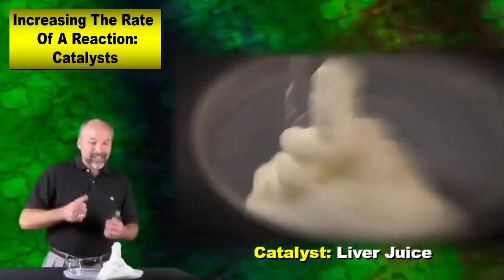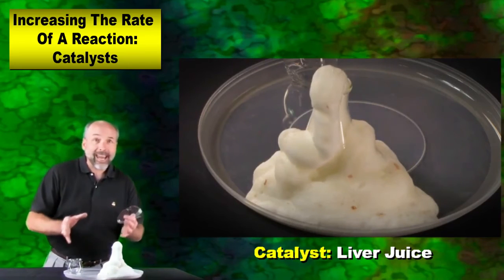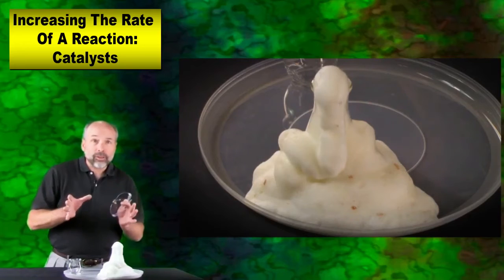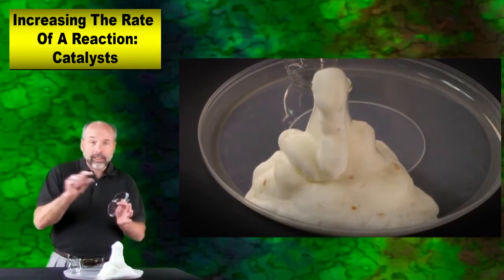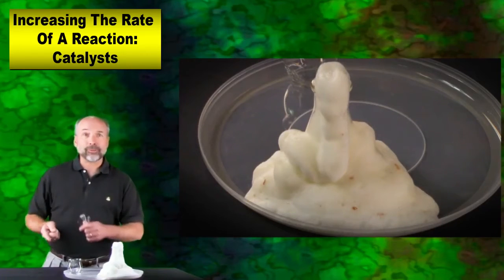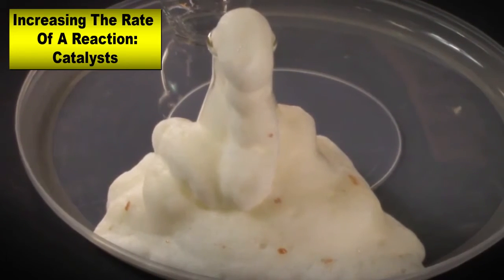Kind of cool. So here we've got this example of 3 different ways we could see catalysts affecting hydrogen peroxide. Each one of these would have its own little energy diagram because we're looking at this little tunnel, this little shortcut that's going to bring the reactants over to the product side. Lots of fun. Here we've got just one dosage of this stuff, and you can still see it bubbling and burping as it's going along.